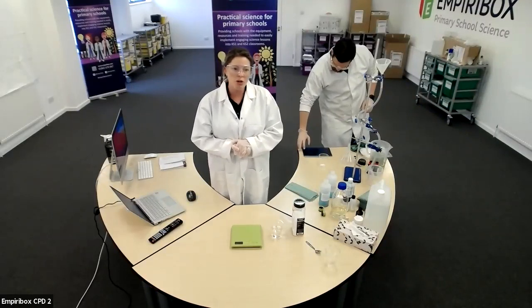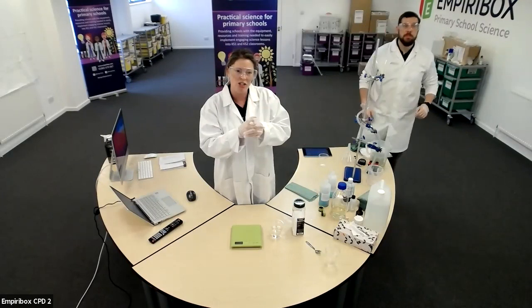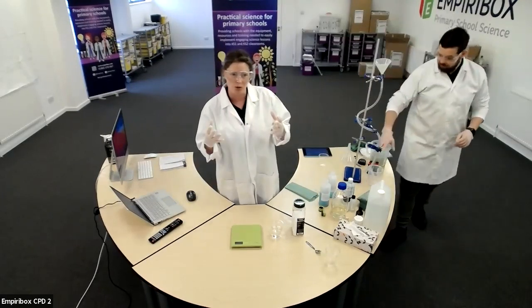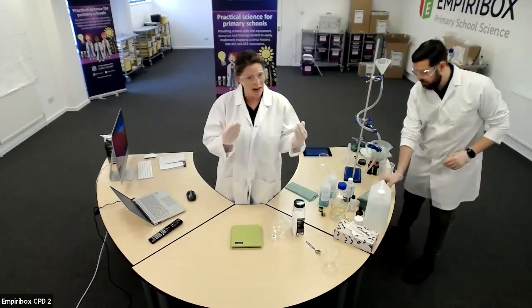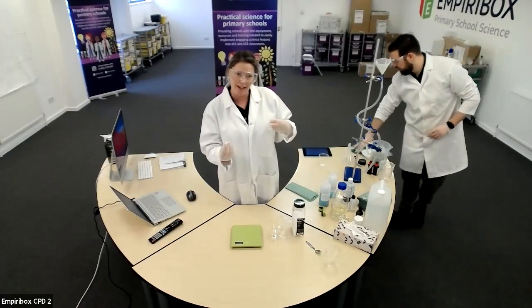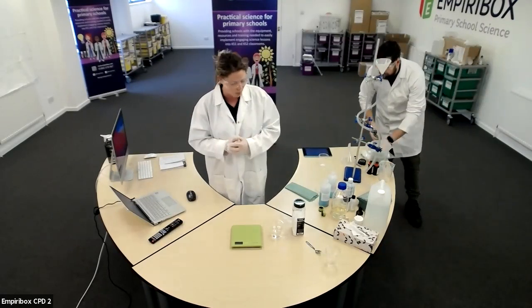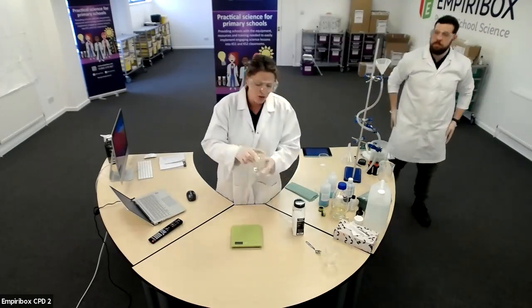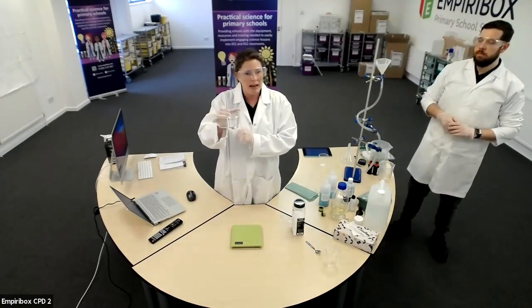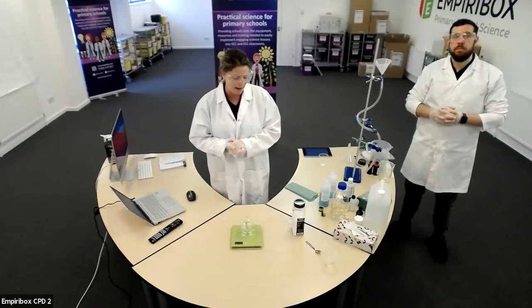So what we want to do then is to put the two chemicals together to form a reaction to see if we can make a new product, okay? Because we have two reactants, which are our bicarbonate of soda and our acid, and then we want to make a product, okay? So react them together to make something new. So what I've done here is I've just added my vinegar into a plastic beaker, and I'm going to pop that onto my balance.